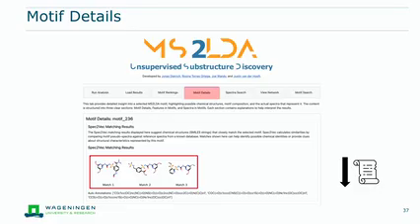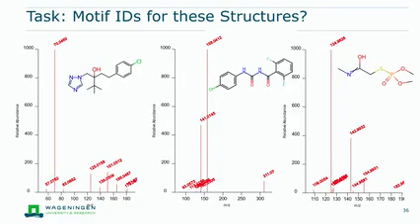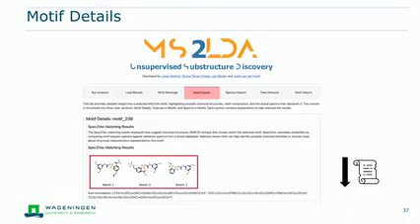So what I wanted to show with this exercise actually is how you would kind of process the data. I think you could just see it a little bit on my screen now, but I encourage you to try it again at home maybe, or during the conference. And then you can easily spot, okay, maybe those are fragments I'm interested in. What is also nice about the structure recommendation, if you know my substructure should be known somehow, and they align very well, then it's a good indication that the structure is actually well annotated as well.